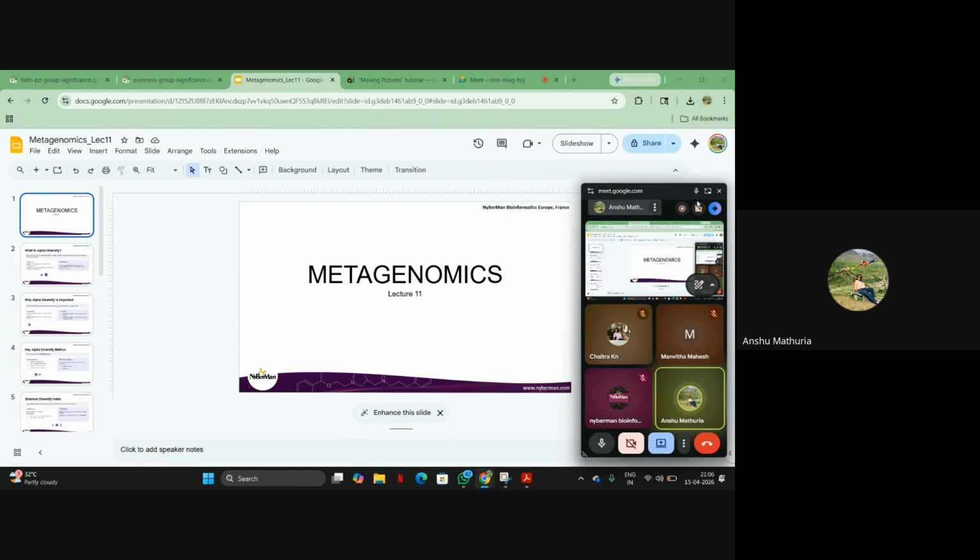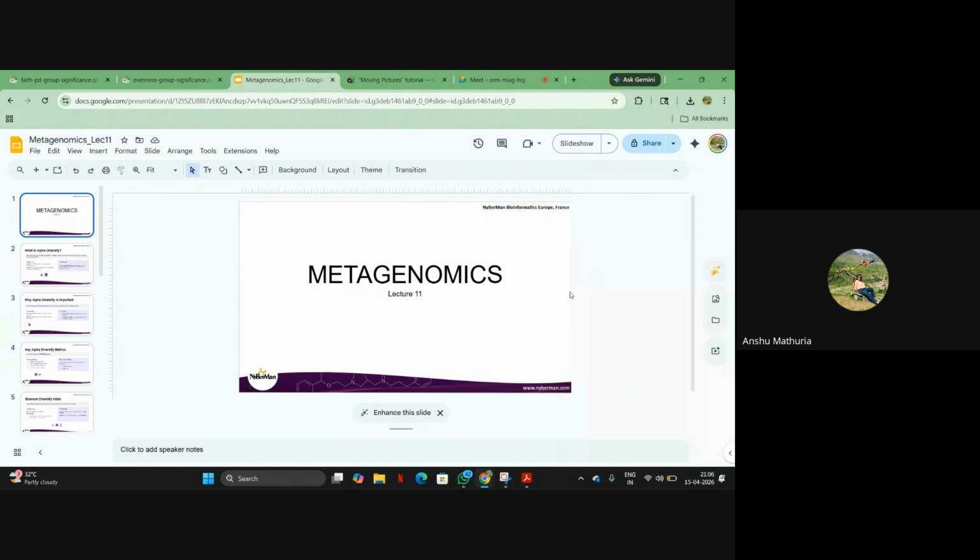So, as I mentioned in the last sessions, once we are done with the construction of the feature table and getting the representative sequences, we can move on to the next steps. From the representative sequences, we constructed the phylogenetic tree by doing multiple sequence alignment, converting it into a code using different indices, and uploading it into a web server where a phylogenetic tree is generated. You can create a rooted and an unrooted tree to check what the evolutionary relationship is between those species. That was one application we can do after we get the metagenome data.